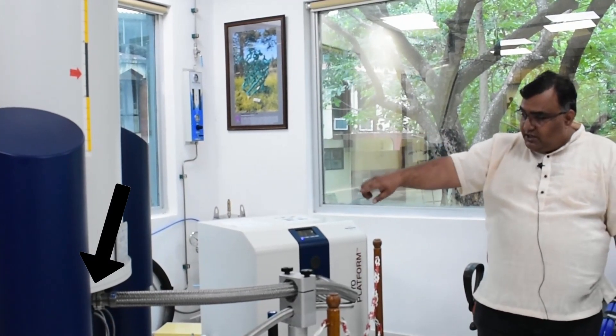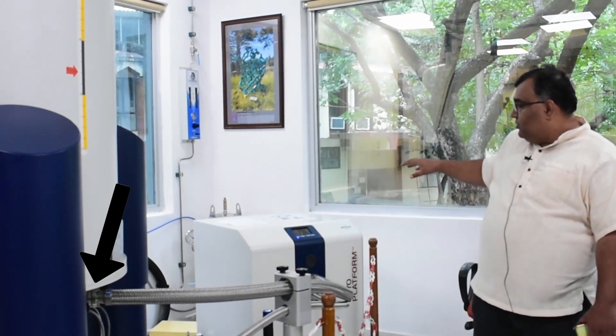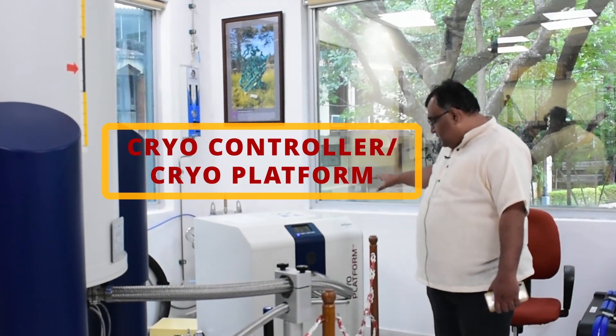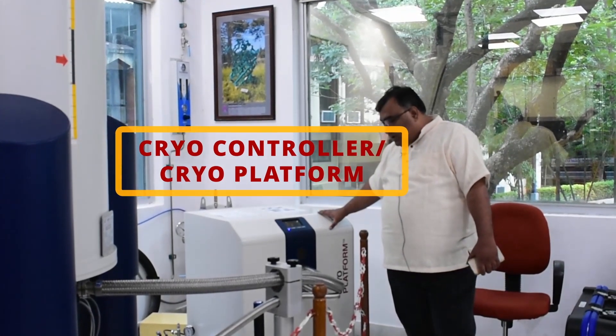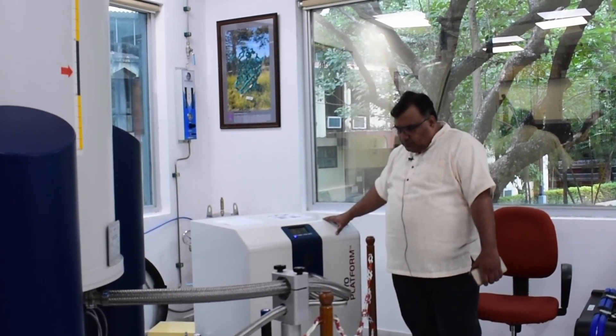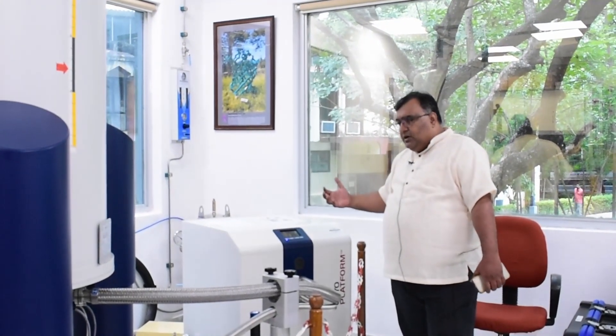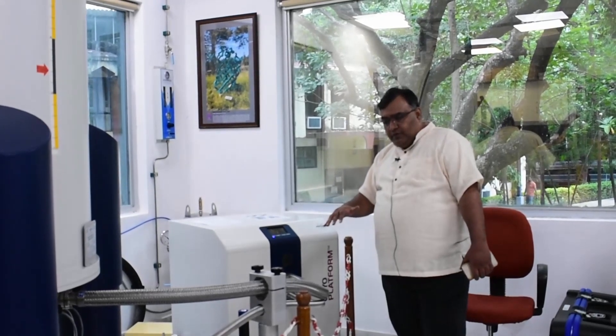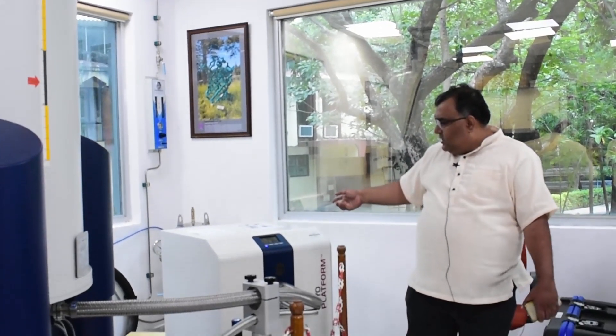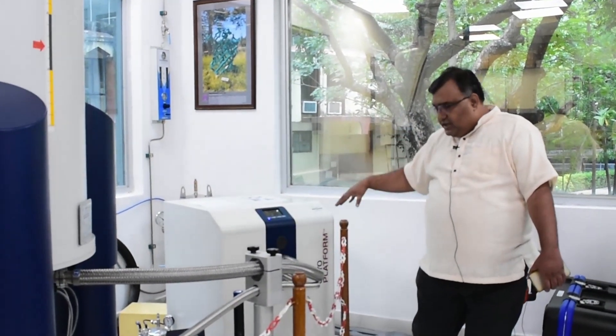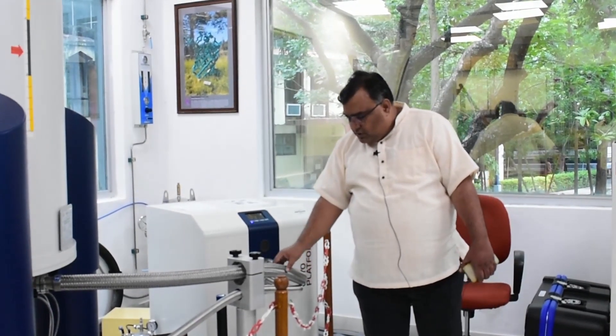Since you have to maintain 17 degrees in that coil area, effectively you need a unit and this is called as cryo control unit or cryo platform. And this platform, this sound that you hear here, essentially is taking the helium, cooling that helium using the Joule Thompson apparatus here inside, cooling it to 17 Kelvin and then passing it through this line.